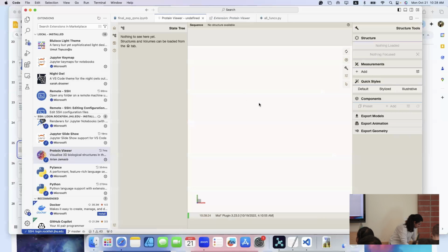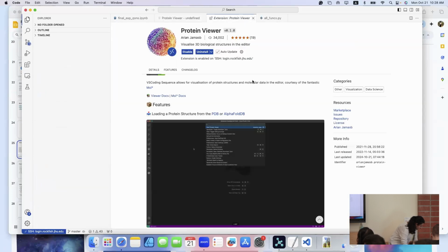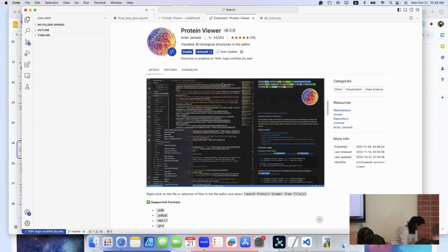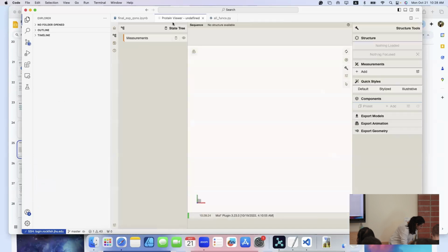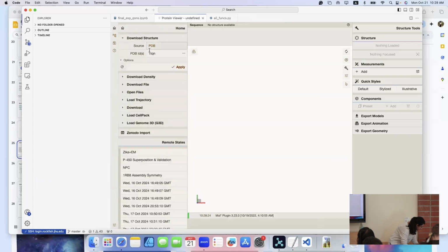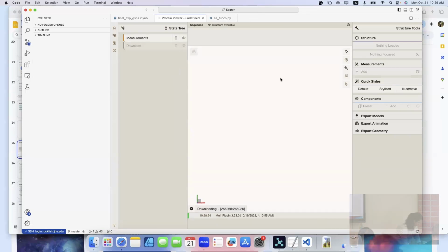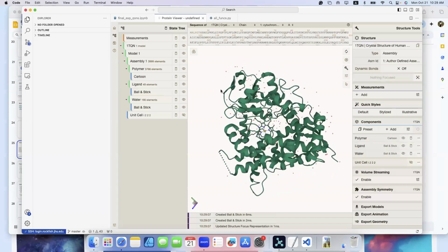And then once I've done this, there we go. Okay, so if I hit that, it will bring in whatever I need to.